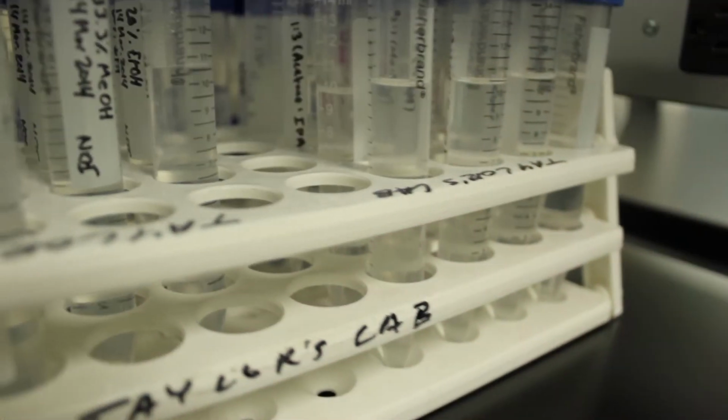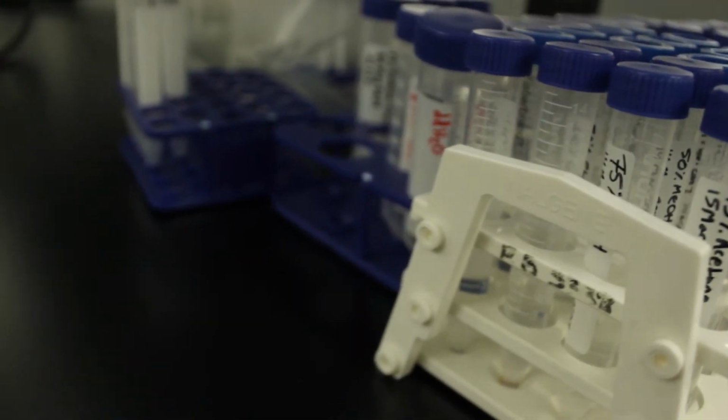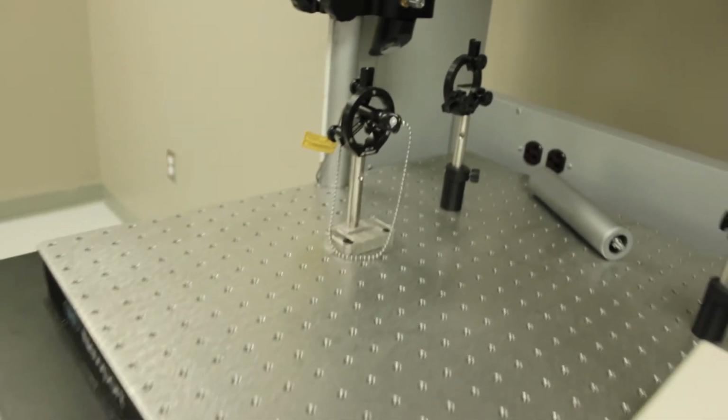In my tissue modeling area, I use different types of cells to see what happens when the cells are stressed out in different environments or when malignant cells are grown in different types of substrates. One of my students is a master's student, and he's working on developing Raman spectroscopy techniques to detect biomarkers of lymphoma and leukemia. What he's trying to do is use gold nanoparticles to detect these biomarkers by enhancing their signal. We use just a laser and a really nice camera and excite those biomarkers with those little nanoparticles and enhance their signal.